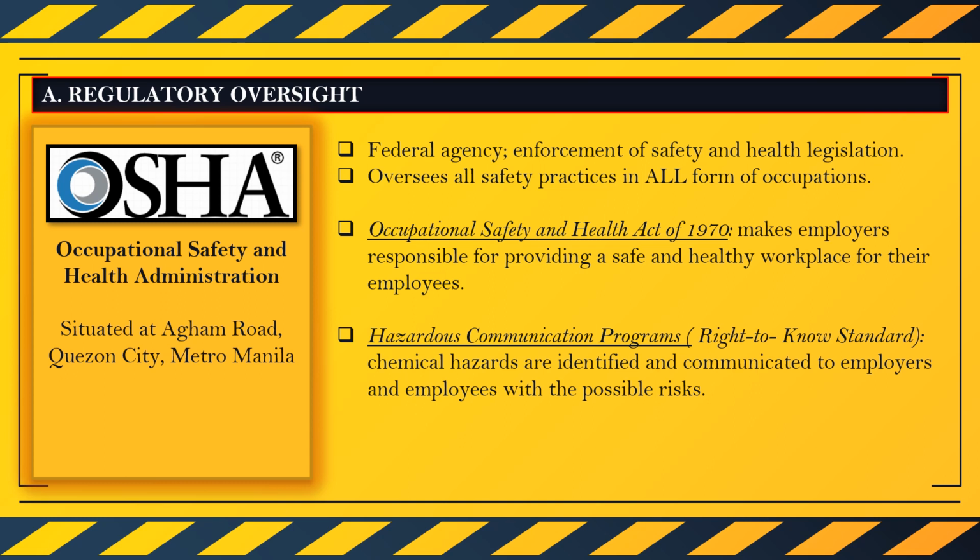OSHA was established in 1970 under the Occupational Safety and Health Act, and its primary mission is to prevent work-related injuries, illnesses, and mortalities by setting and enforcing standards, providing training and education, and conducting outreach activities. Also, the Hazard Communication Program, which is also known as the Right to Know standard, ensures that the chemical hazards in the workplace are identified and the information concerning these hazards is communicated well to the employers and to employees.